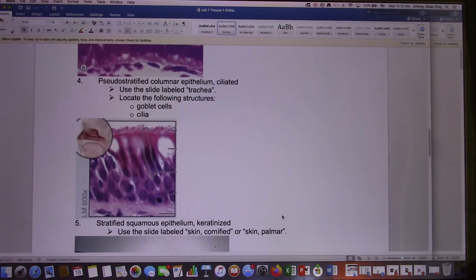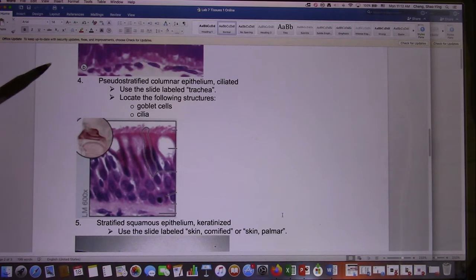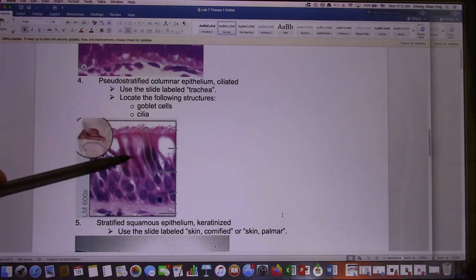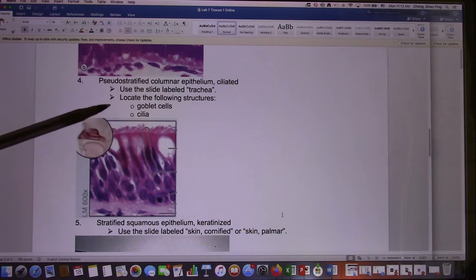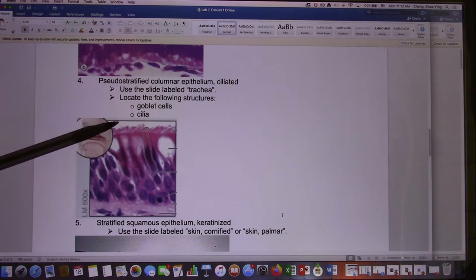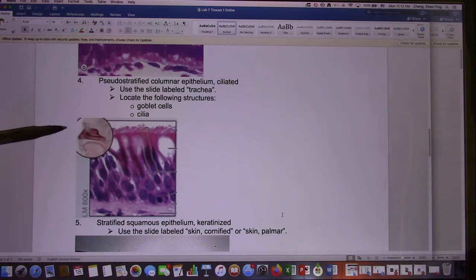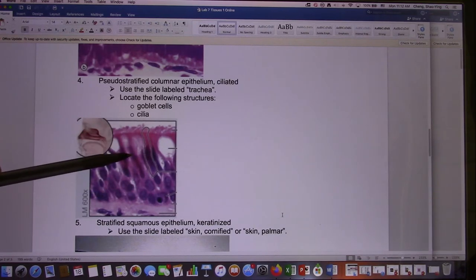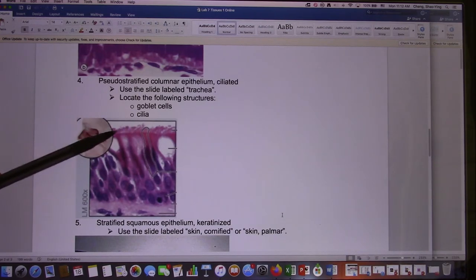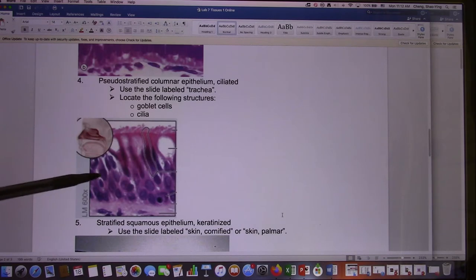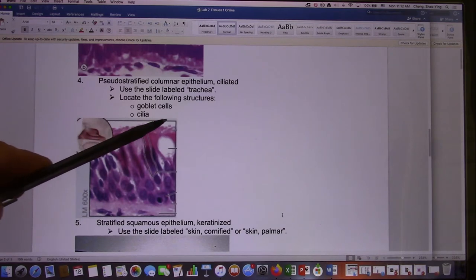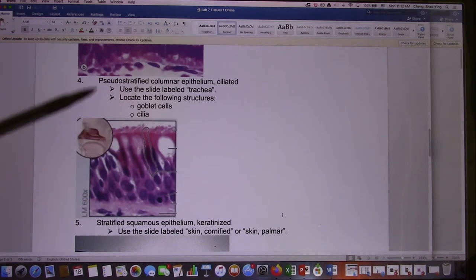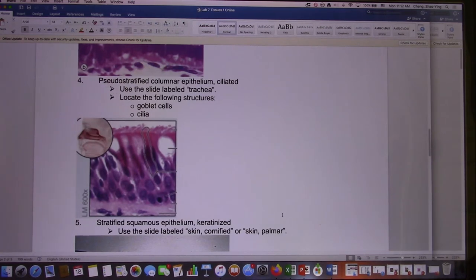Next one: pseudostratified columnar. You find them in your airway. They look like multiple layers, but all of them attach to the basement membrane, so it's actually one layer. In the airway you also have cilia — that's another characteristic. If I give you a slice from the airway and it looks like multiple layers but all attach to the basement membrane, then you look at the cilia — it's almost guaranteed this comes from the airway. So this is the pseudostratified columnar — that would be the correct answer.